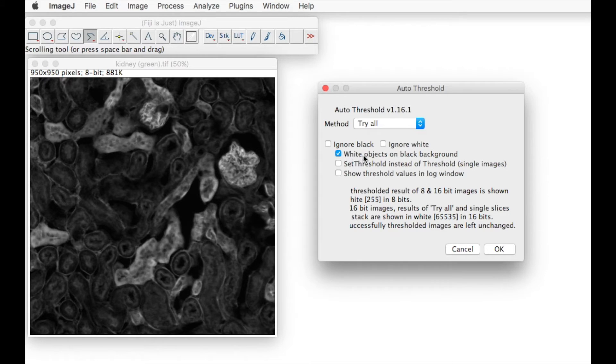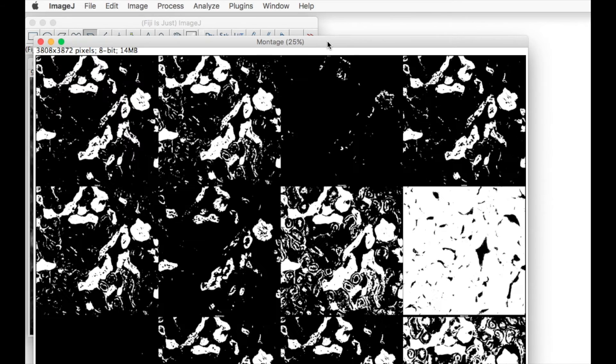We want to look at white objects on a black background and we want to show the threshold values in a window.